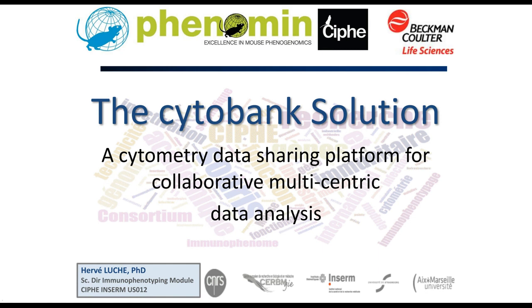Many thanks for this kind introduction and good morning. Hello everyone. So I'm going to present you this webinar on the Cytobank solution and how we use it at the Center of ImmunoPHEnomics to drive our collaborative multicentric data analysis.